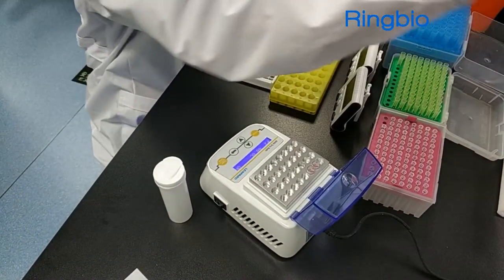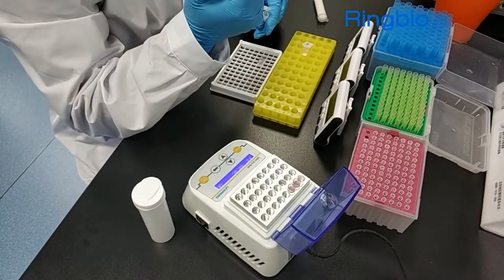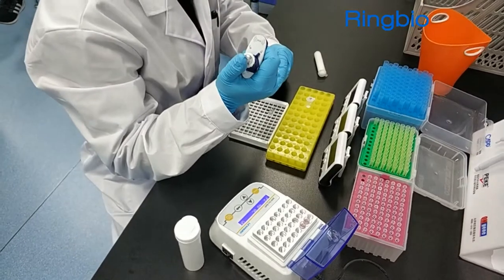In this video, we run 6 tests together, 2 negative tests, 2 beta-lactam positive tests and 2 tetracycline positive tests.